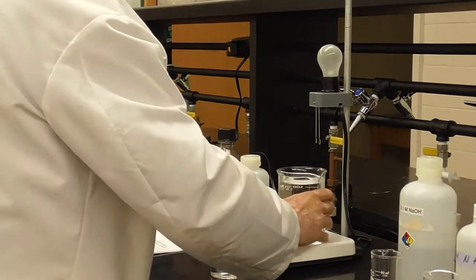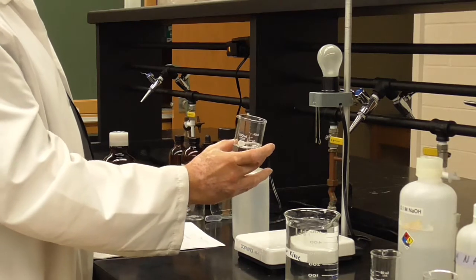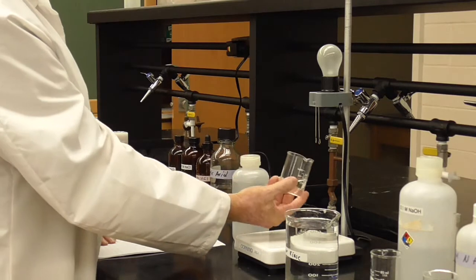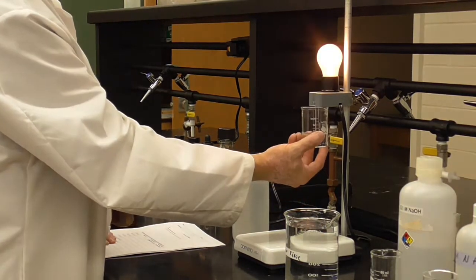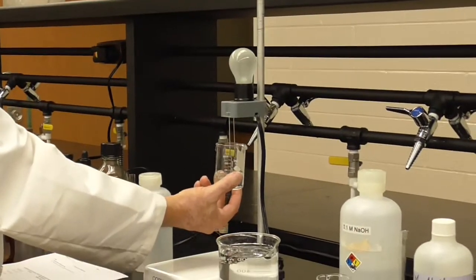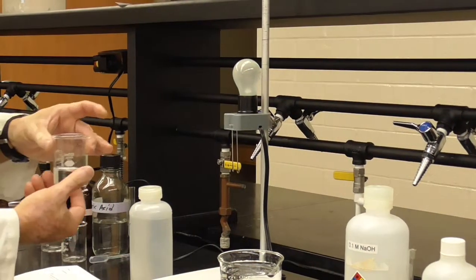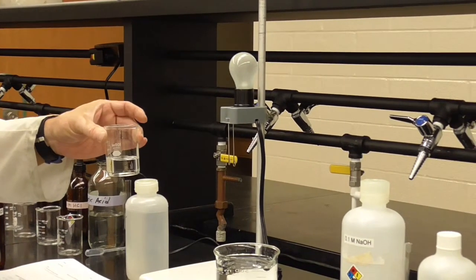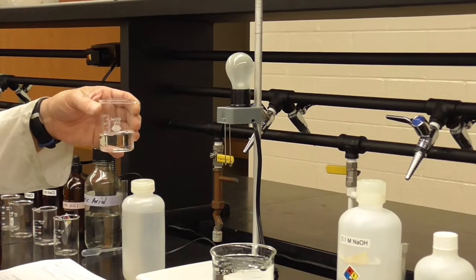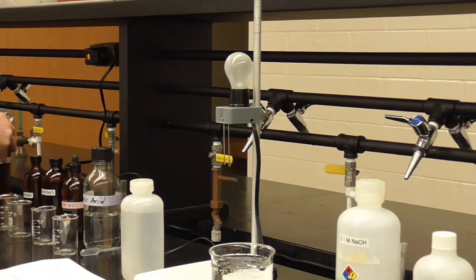So, let me get this DI water out of the way. Okay, here we go. A solution of sodium chloride, 0.1 molar. I'm just going to lift this up so the solution touches those two wires, and then we'll see, does it actually make contact. And you can see the light goes on very brightly, not a problem at all. So when I go up and those go into the solution, it connects them. So electricity is allowed to flow through that solution. That's what that means. I would classify that, therefore, as a strong electrolyte. It strongly allows the flow of electricity.